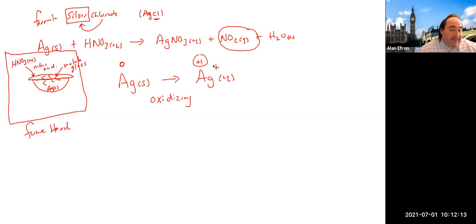It needs a positive charge, because ultimately this is a metal, and this is a non-metal, which means we need our non-metal to be negatively charged and our metal to be positively charged so we can get that ionic bond to occur. So this first process where we treat it with the nitric acid is where we oxidize the silver so it's able to accept the chloride in, to make this solid.